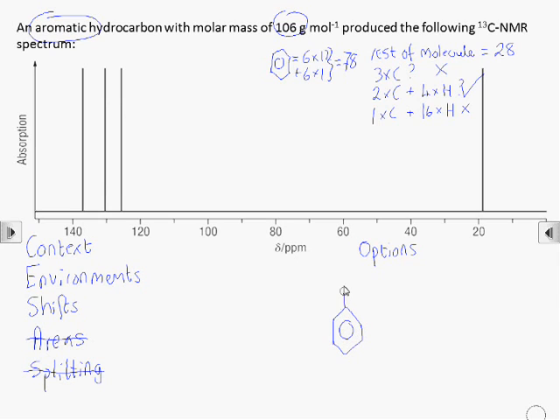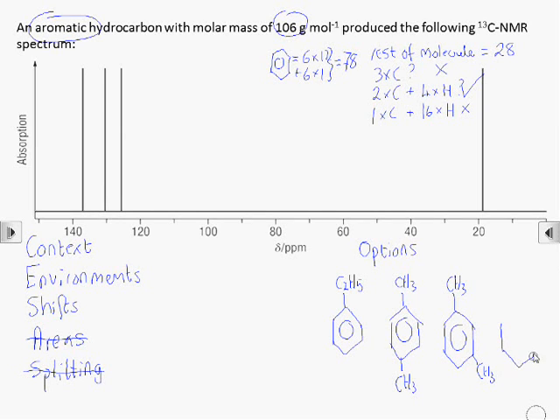So we could have a benzene ring with an ethyl group connected to it. We could have a benzene ring with a methyl group, and then another methyl group connected in one of three different positions. So that's 1,4-dimethylbenzene, here's 1,3-dimethylbenzene, and we could have 1,2-dimethylbenzene.